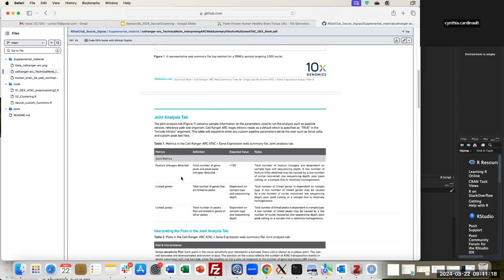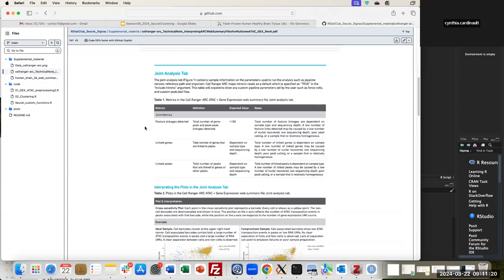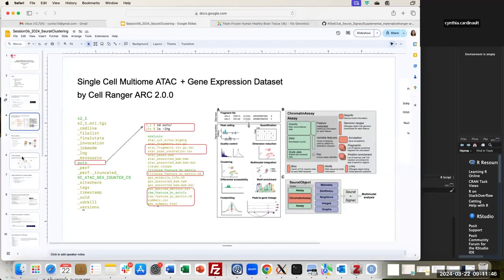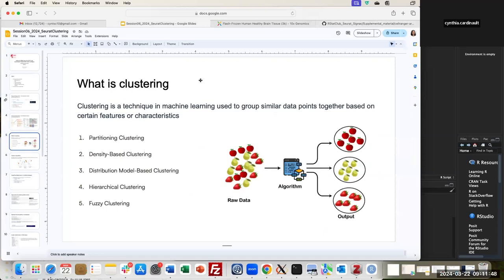You can look at each one of the properties described as metrics, like feature linkages, linked genes, and linked peaks. Here we have definitions, thresholds with expected values, and additional notes. Now that we know what information we will handle today, let's go back to the main topic for this talk, which is clustering.